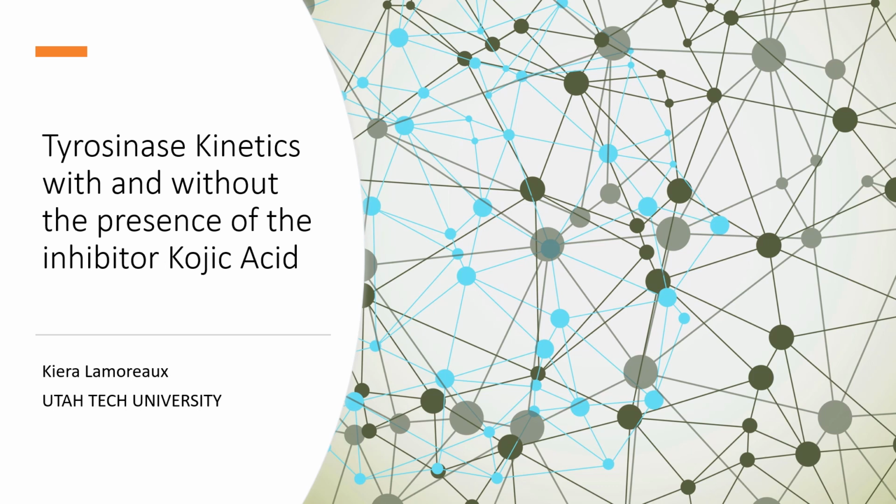Hi, my name is Kira Lamro, and today we're going to talk a little bit about tyrosinase kinetics, specifically with and without the presence of the inhibitor kojic acid.